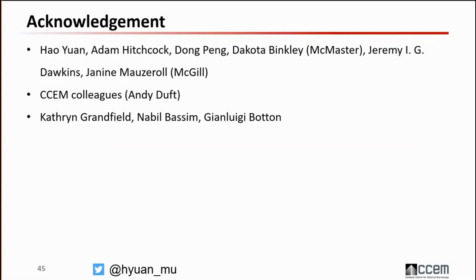Yeah. Okay, so the first question was, in the case of type 2-4 samples, which is the best protective layer: carbon, platinum, or tungsten? This was also a question for me when you bring your sample. Carbon is the hardest one, and platinum is the softest one. So typically you want to adjust the deposition to your samples. After that, you might need to run a small tomo, as I showed, or some very quick cross-sectioning to see which is the best deposition you can use.